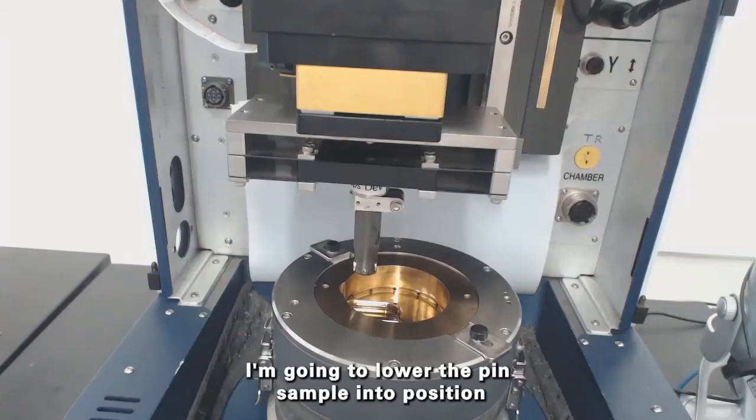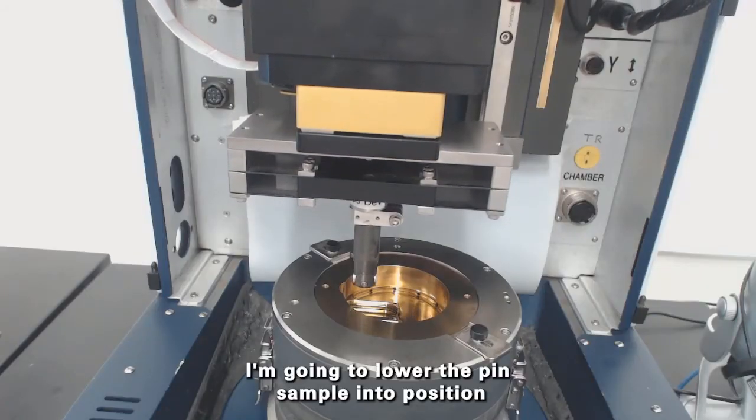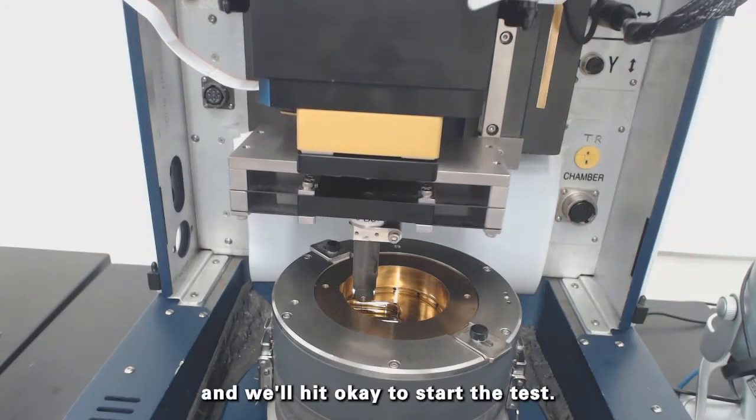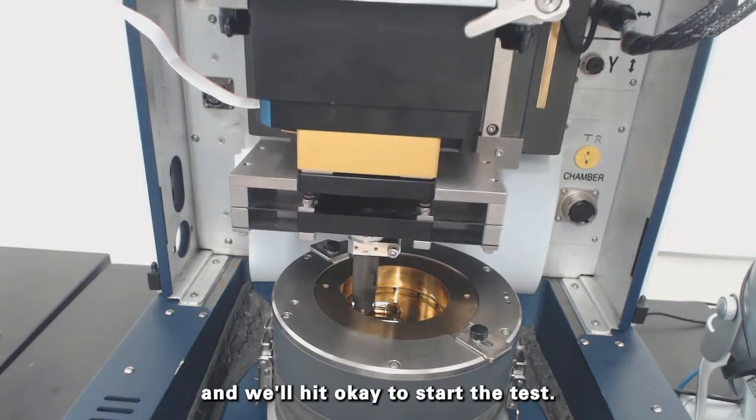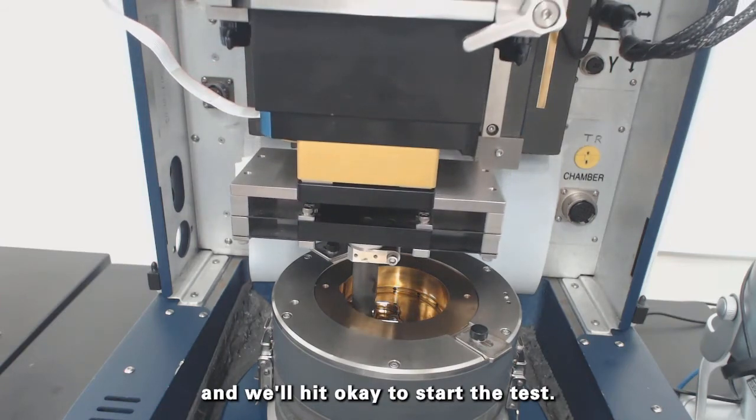I'm going to lower the pin sample into position and we'll hit OK to start the test.